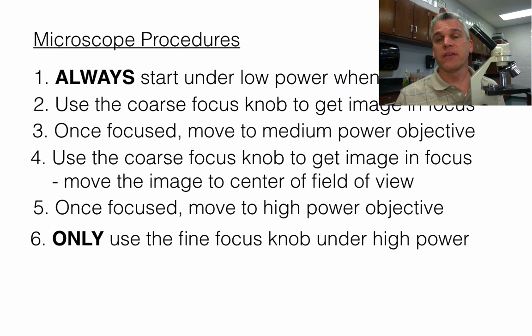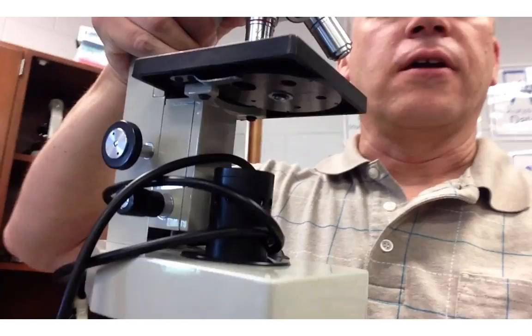So to recap: use two hands when you get your microscope out, put the microscope on the center of your desk, and when it's time to put it away, walk over to the microscope cabinet. Make sure your microscope is on the low power objective — not medium or high. The cord is just loosely wrapped around the base. Put it away right in its spot. It's that easy.